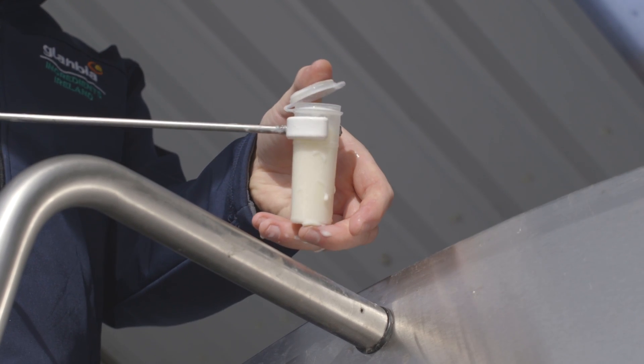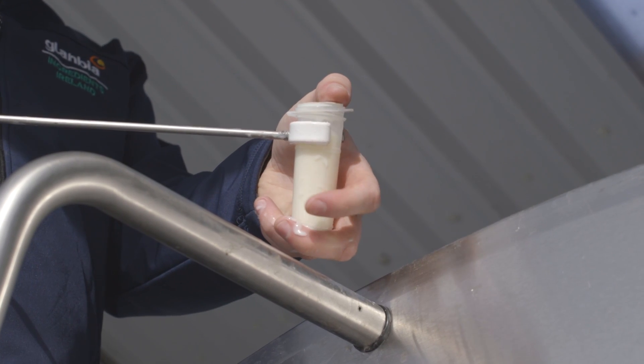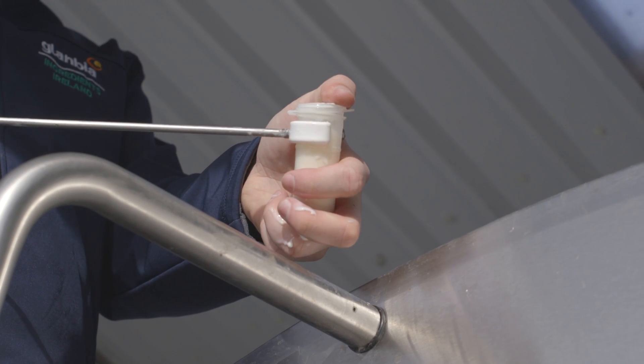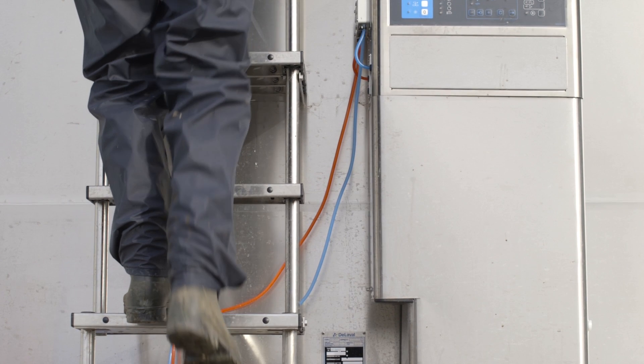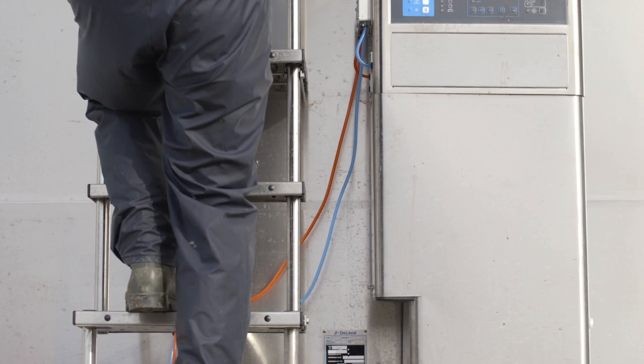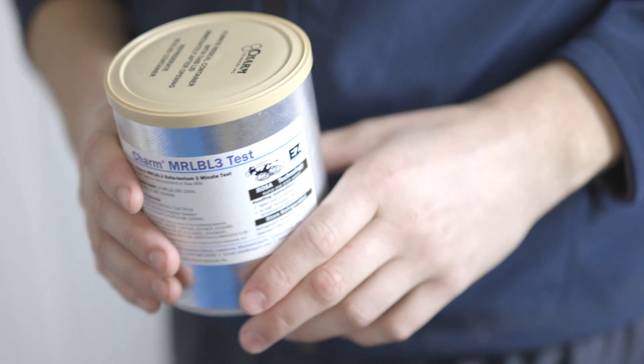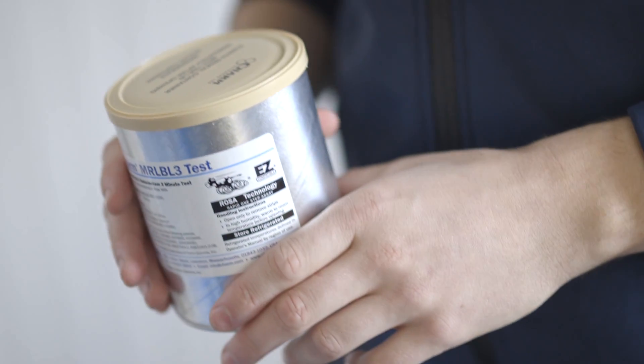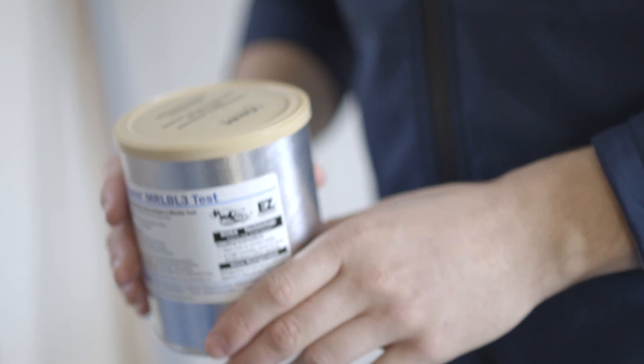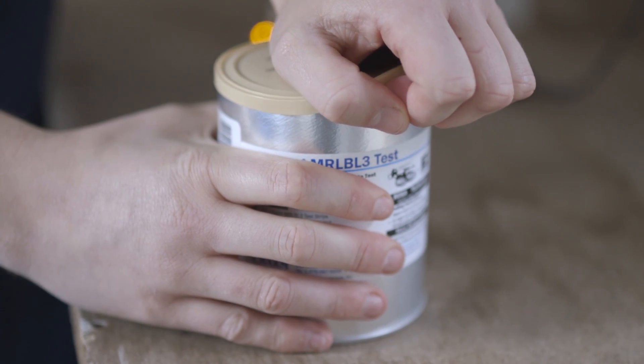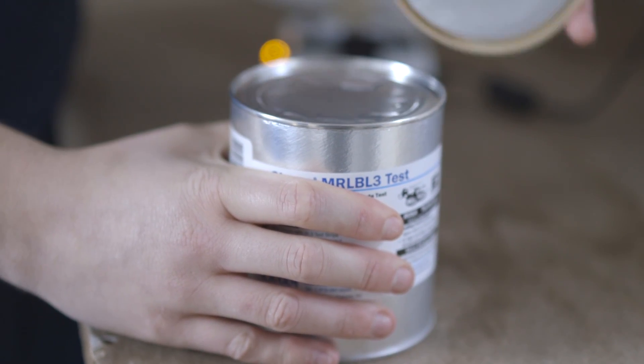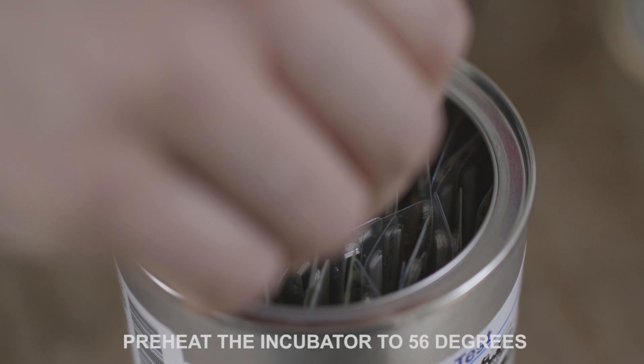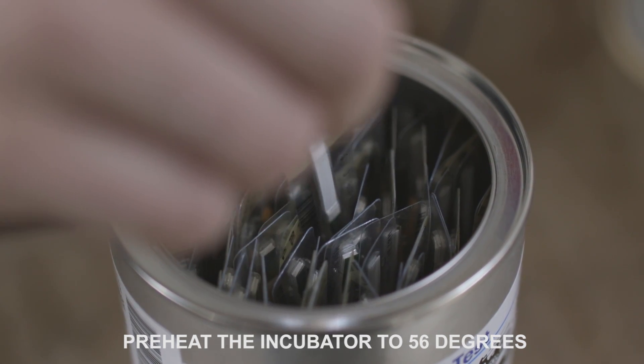It's very important for the farmer to know conclusively whether his milk is antibiotic free or not. The Charm Kit is very easy to use, it's a three minute test and gives you an almost instant answer to whether my milk is antibiotic free or not.